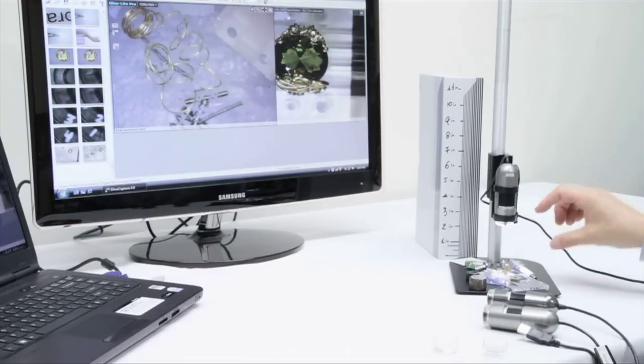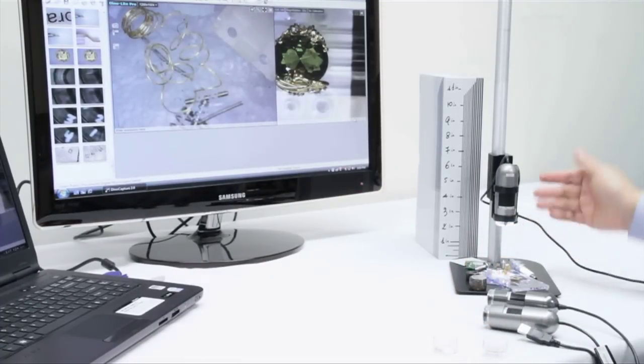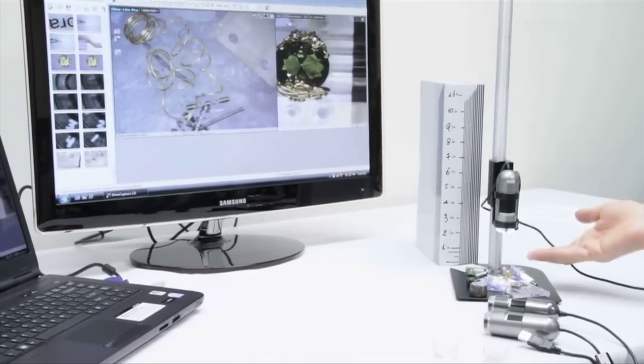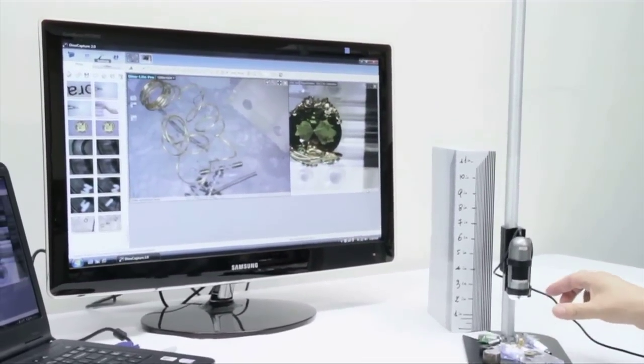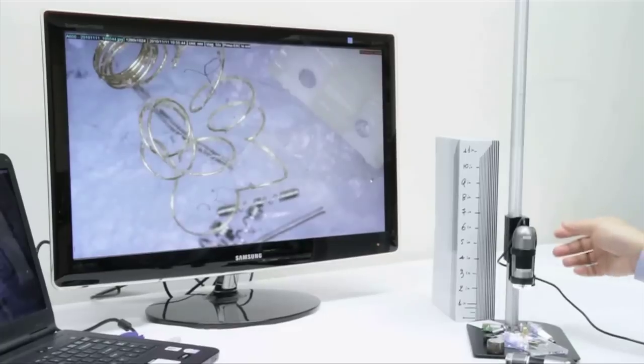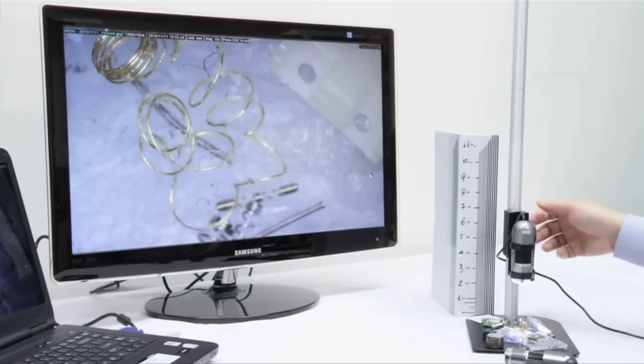As you can see here, we're sitting at about 3 inches away and in order to get different magnifications you just move the microscope higher or lower. And that will change the magnification as well as the field of view.